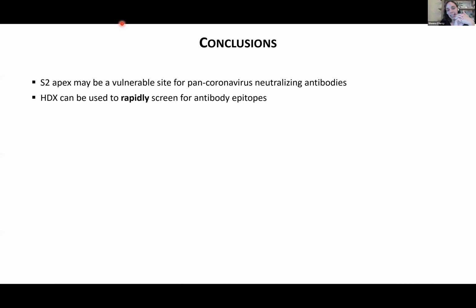Yeah, that's an excellent question. So not just for antibodies, but just in general. I mean, most of the questions you just raised relate to any sort of interactions that we're looking at. So I think that the affinity question, here we had a quite tight affinity. I think we were in the nanomolar range. But in my previous example, we sort of had some of those micromolar binders.